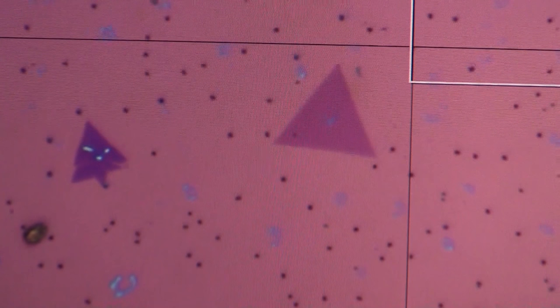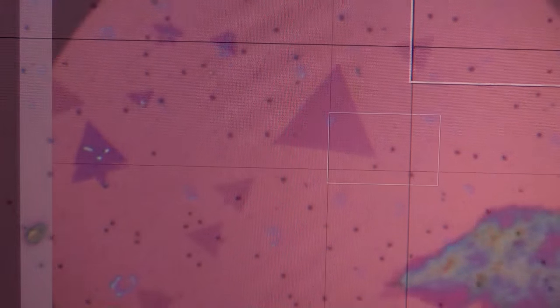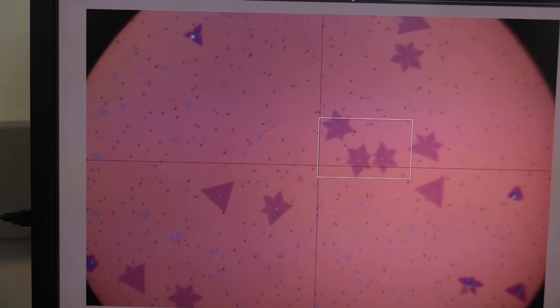And if you look closely at the center there, you can see where it nucleated from. That is very common, but not necessary.